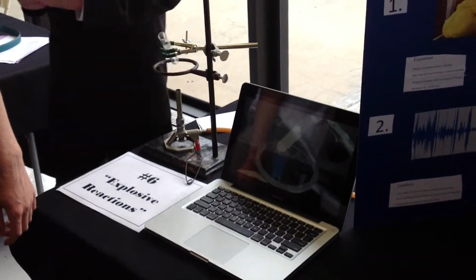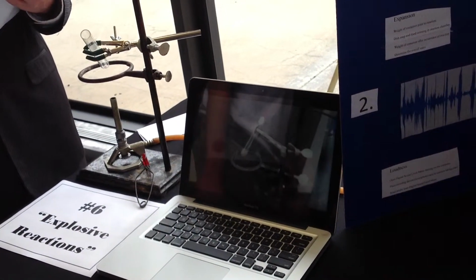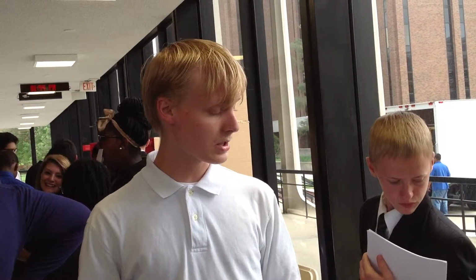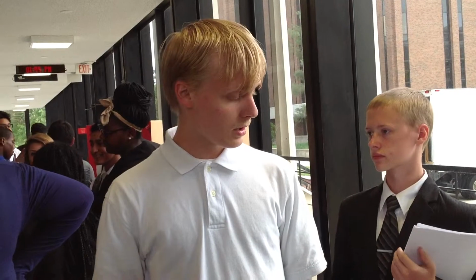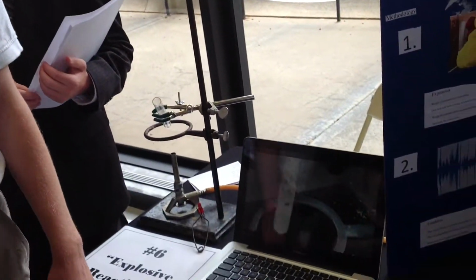Of our demonstration of the kind of reactions we'll be speaking of in this project. That was potassium chlorate. We melted it to a molten state and then dropped a gummy bear in. What's happening here is the sugar inside of the gummy bear is reacting with potassium chlorate. The steam coming out is the water vapor, and the black residue forming around the insides of the test tube is the carbon from the sugar.